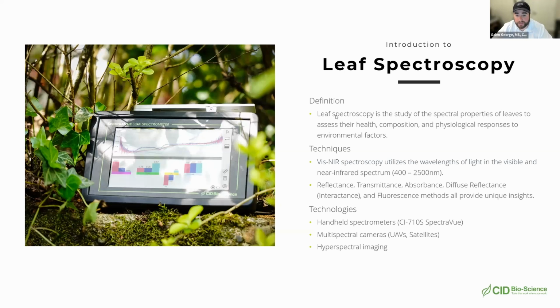So if you are hoping that this technology will replace sending in your samples for triple quad LC-MS/MS analysis to get your cannabis profiles, then I'm unfortunately going to have to report that that's never going to be the case. If you are simply looking for total cannabinoids or just generically THC or CBD, then this technology might be able to model those pretty well. The problem is that when you get to the super trace levels of stuff, it doesn't do very well. And especially when you're trying to separate out different isomers of a single compound, it's not going to do as well with that.